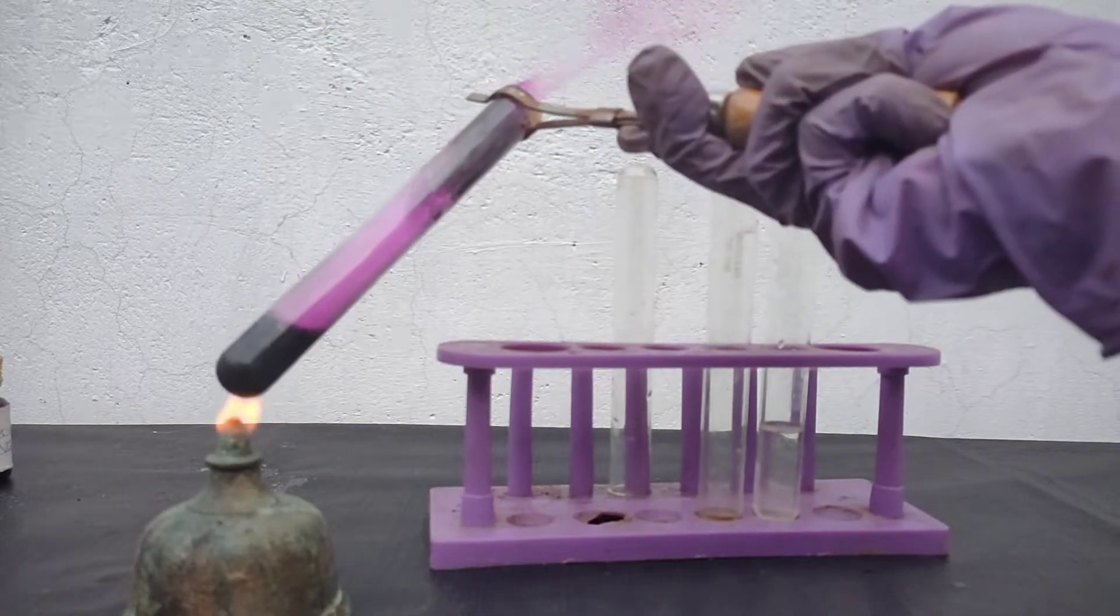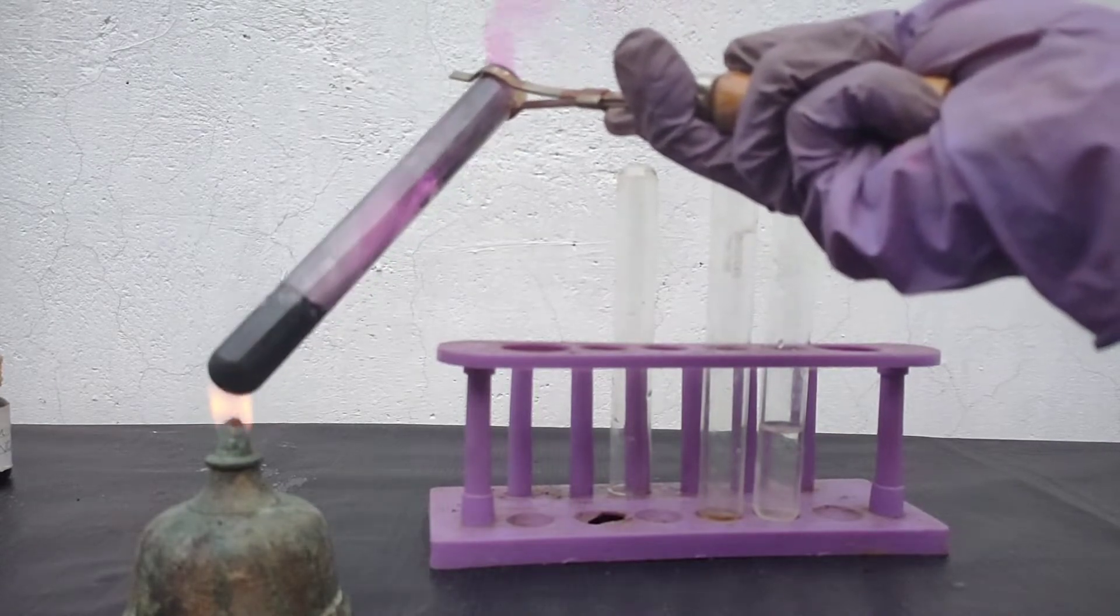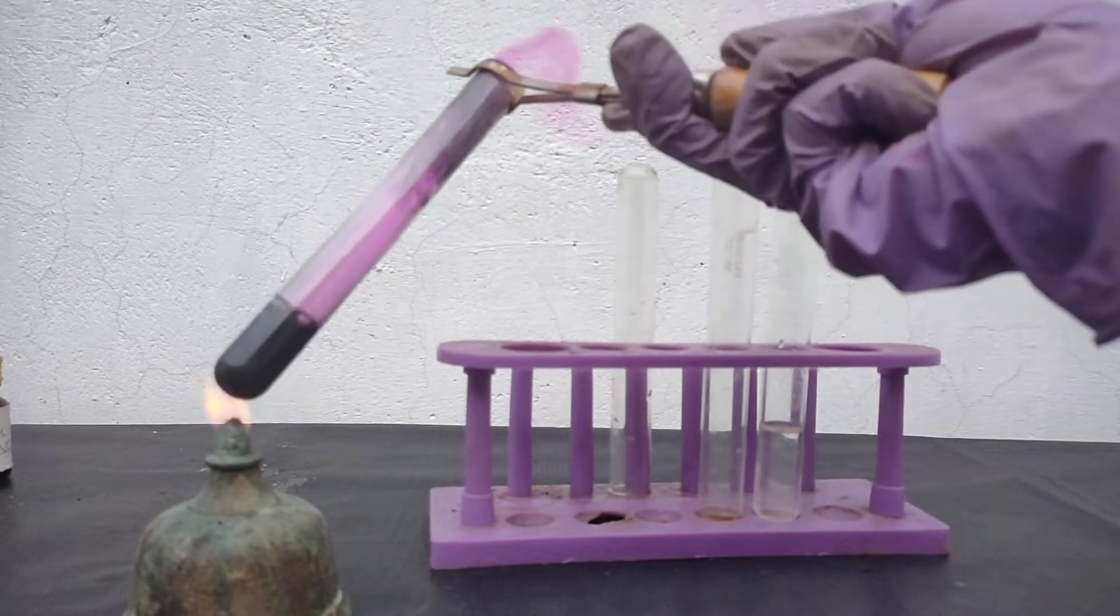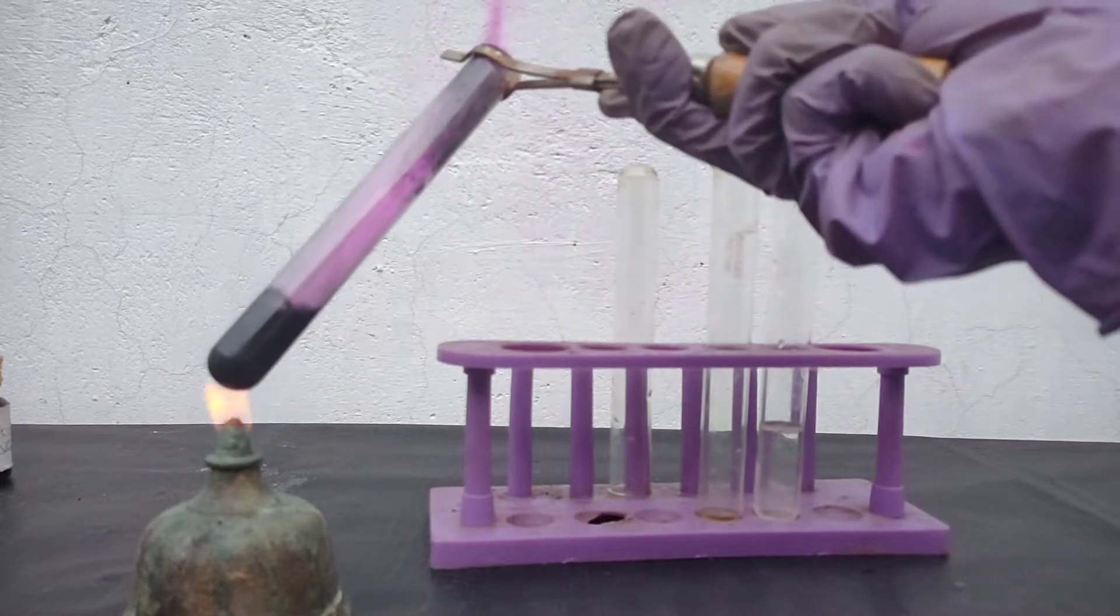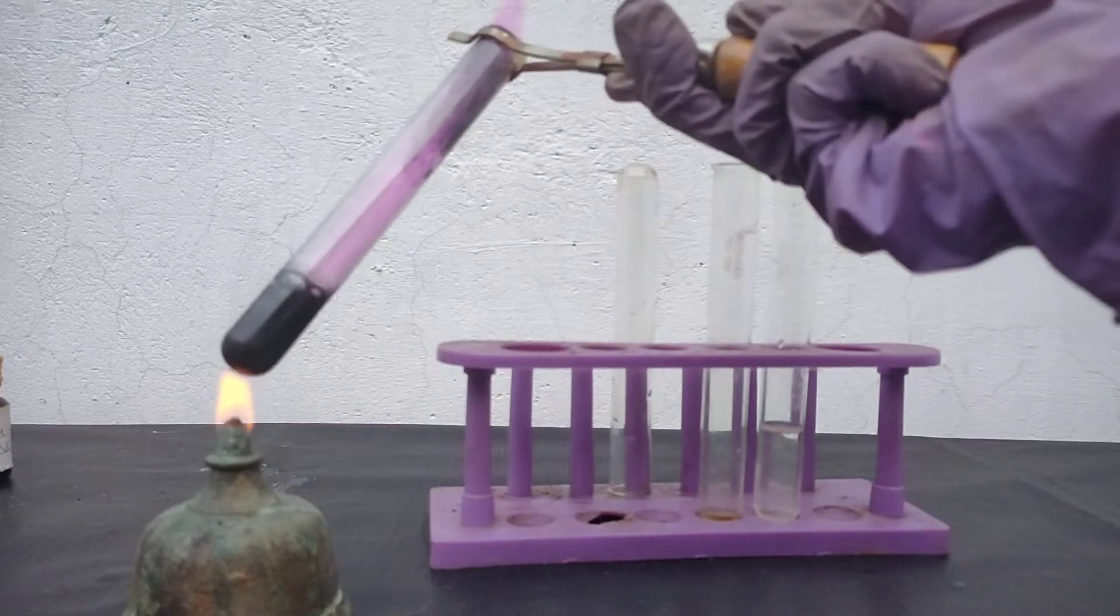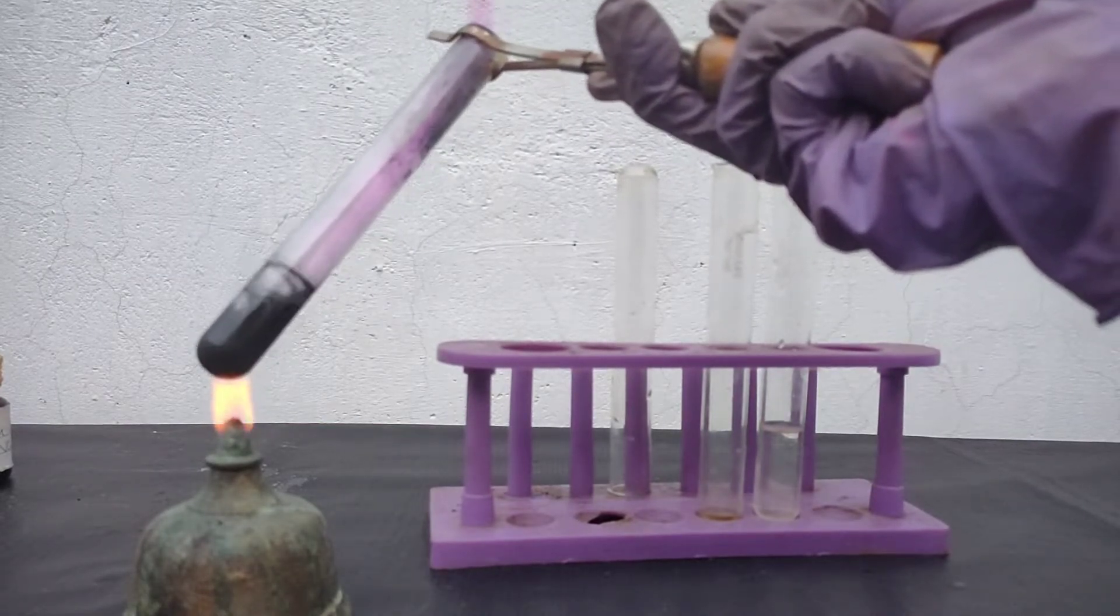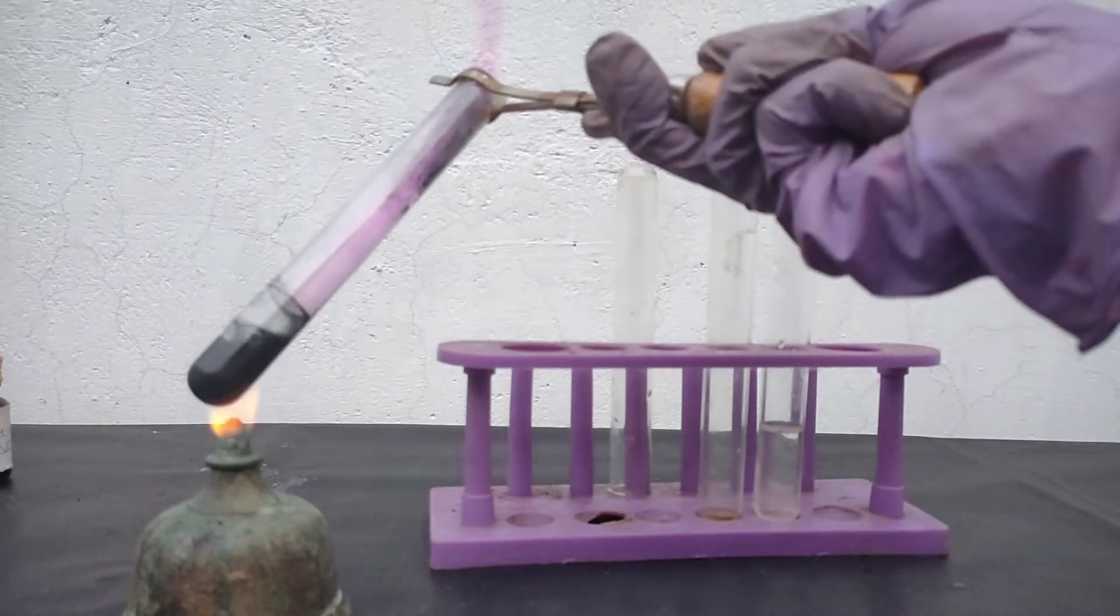On adding manganese dioxide, the violet vapor becomes more clear. Previously it was reddish brown in color, which was due to the presence of hydroiodic acid which was also produced. But now after adding manganese dioxide, all the hydroiodic acid is oxidized to iodine. That's why you see a stream of violet vapor.